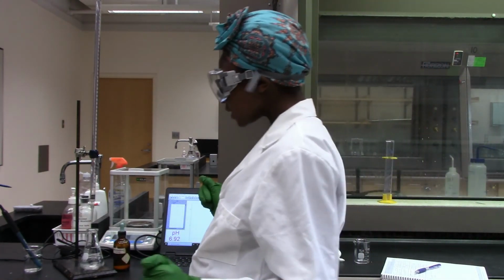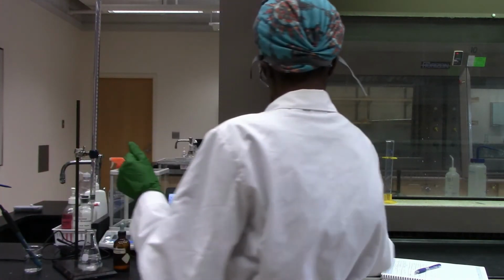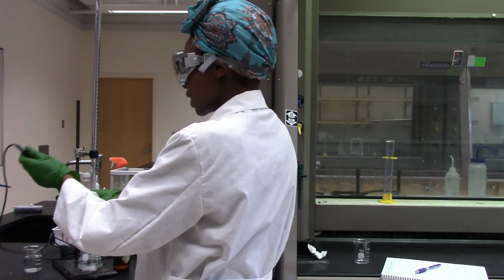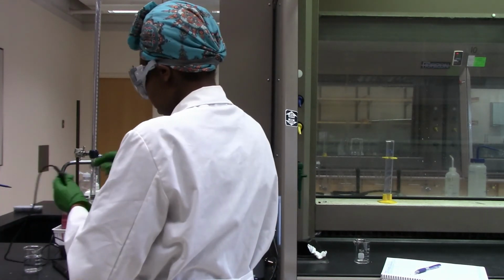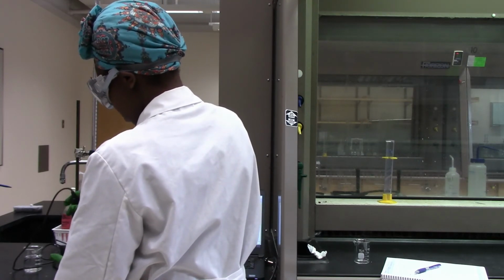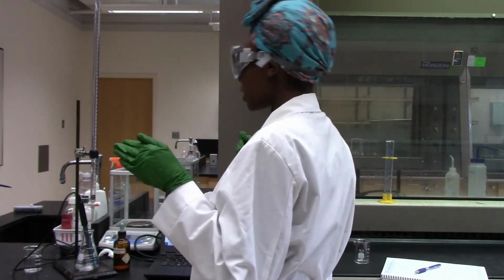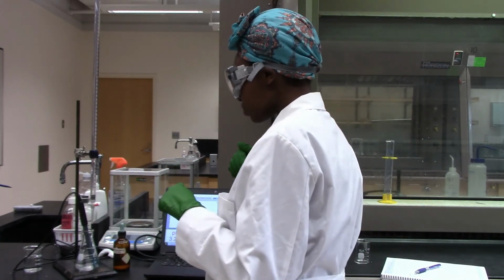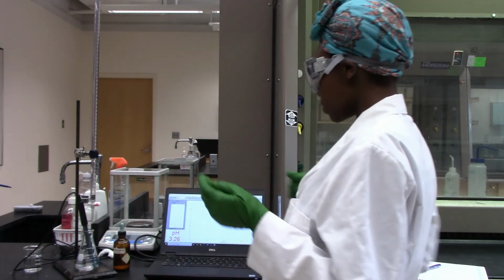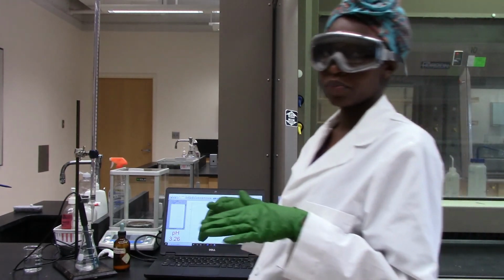So let's get started. We have a pH meter here, which I am going to take out of the water and just insert in my solution. And as I add various amounts of sodium hydroxide, I'll record the volumes as I go, so that I can have the pH against the volume on my Logger Pro.